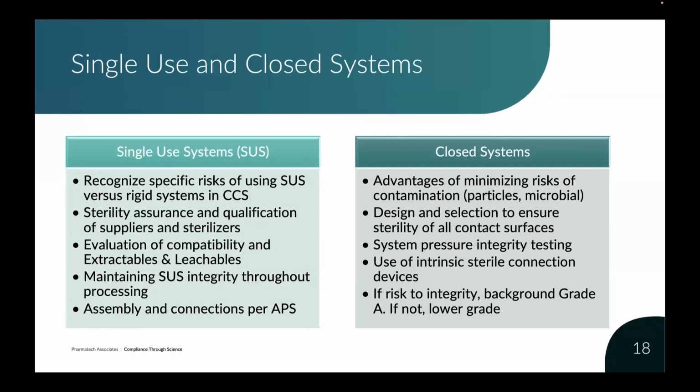More briefly about closed systems. The real advantage of closed systems is it minimizes contamination of particles and microbials, right? You have a completely isolated, sealed system. Design and selection of these systems must assure sterility of all the contact surfaces within these systems. You need to have system pressure integrity testing performed regularly. And generally, you're going to be using what are called intrinsically sterile connection devices.